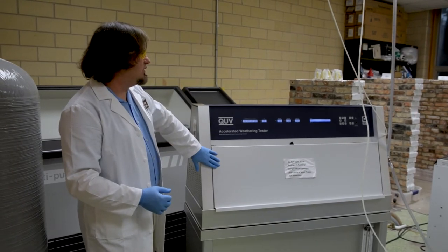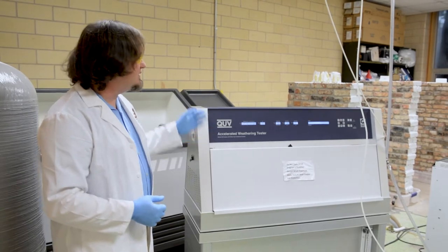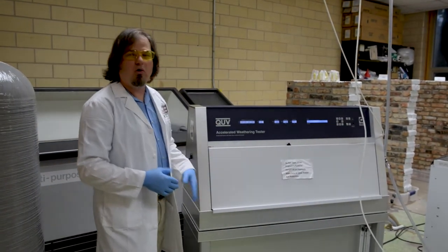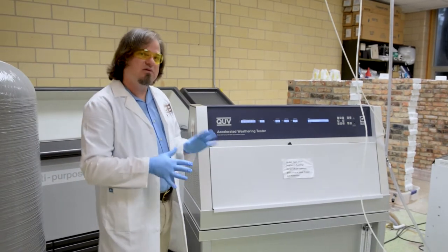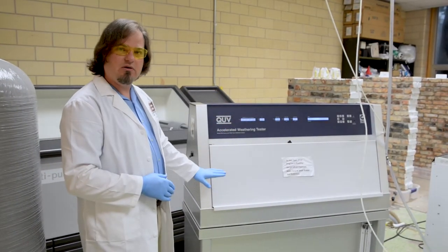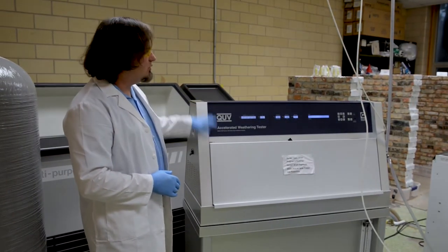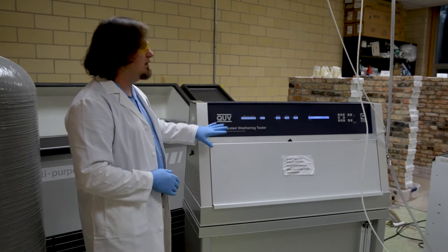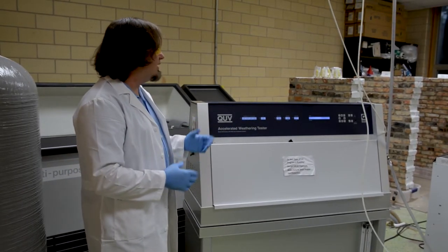The samples are weathered in here for a variety of times. For example, these samples are only weathered for about 400 hours, which would be about six months out in the real world. They go through a light cycle and a dark cycle, which causes a humidity change. So the samples are exposed to moisture, humidity, and UV radiation — a wide variety of conditions.